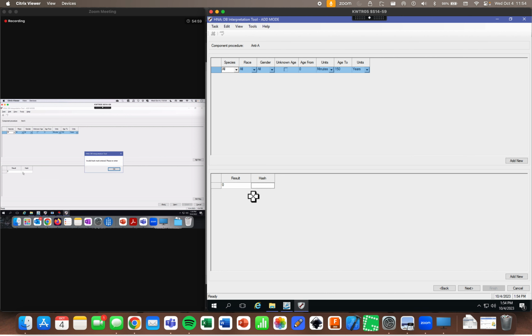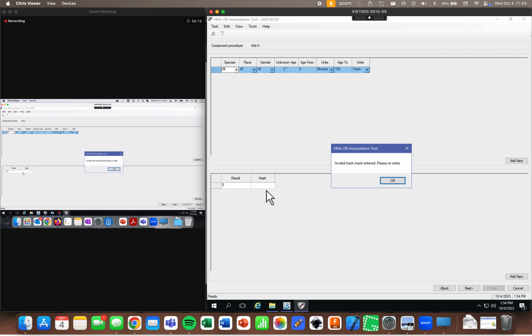We've already discussed that the interpretation tool is not a fan of special characters, it's not a fan of punctuation, but it's perfectly fine with alphanumeric. So if I just hit the 0 key on my keyboard, what's the dealio? Well, it turns out to be another artifact of just how old this tool is.